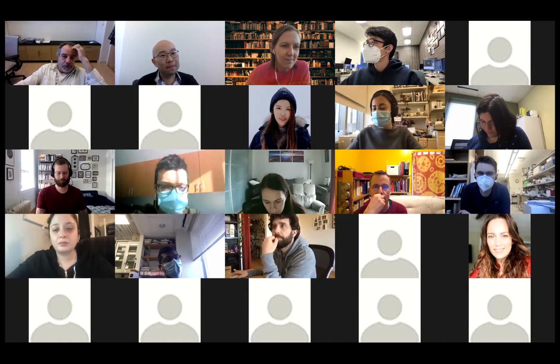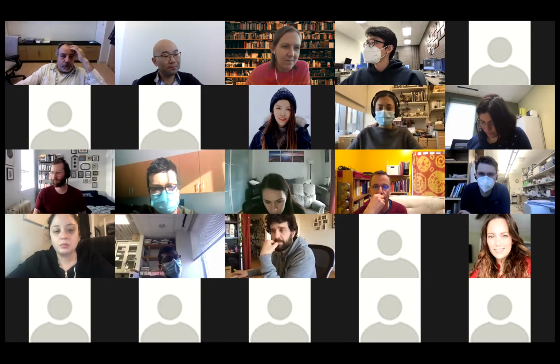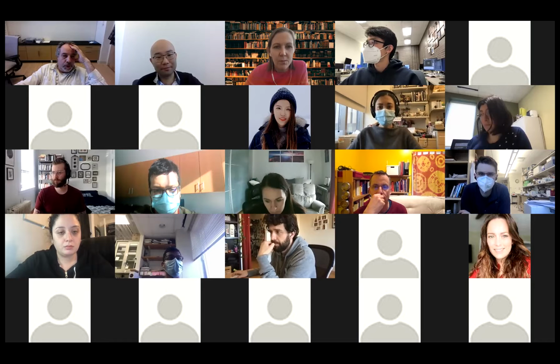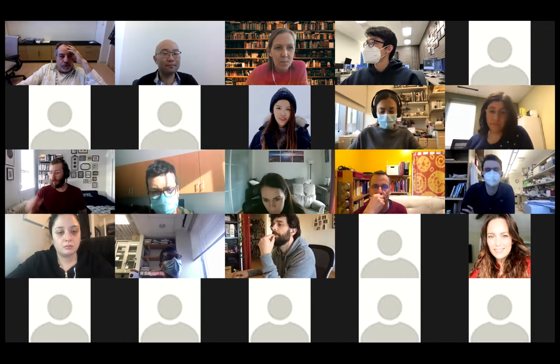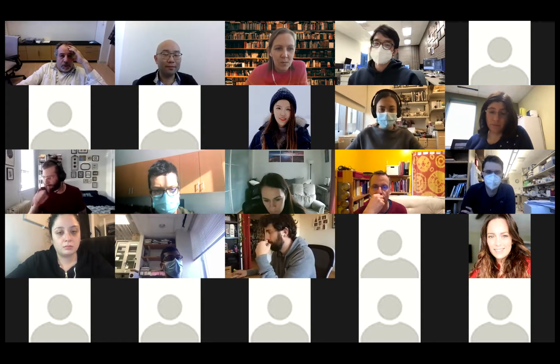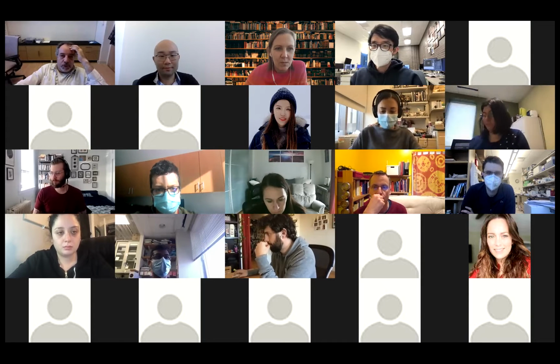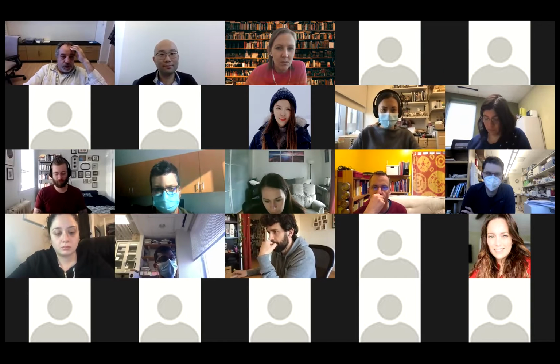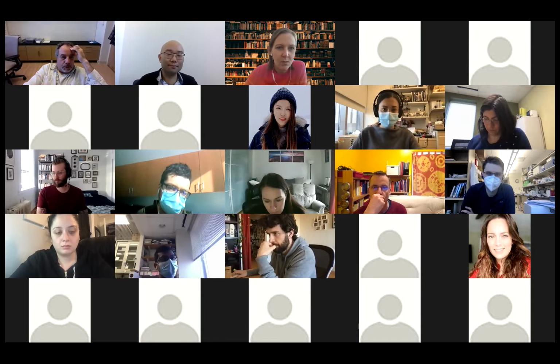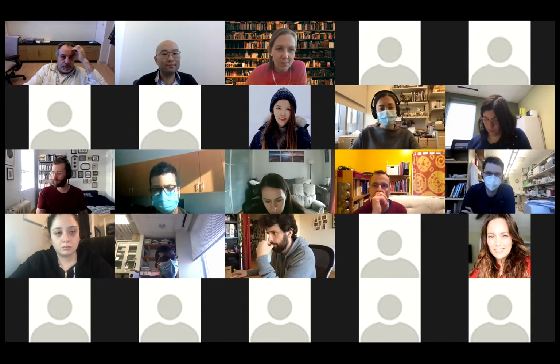Well, that's different. Now you talk about atomic models, and atomic models, if you submit them, they go through all kinds of validation. So that's not what I talk about. I'm talking about maps. But for X-ray, for atomic structures, there are all kinds of different ways that you can validate them. And so if you submit a map and the model that you built, your model will go through these validations. And you will not be able to submit a model that is bad or pretty bad.